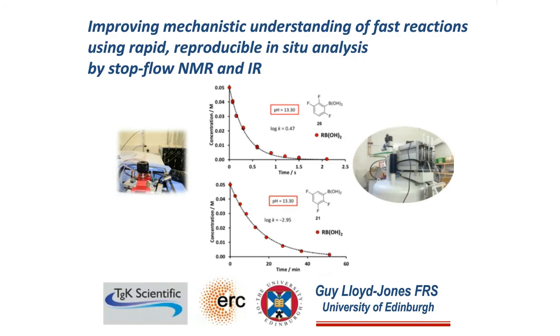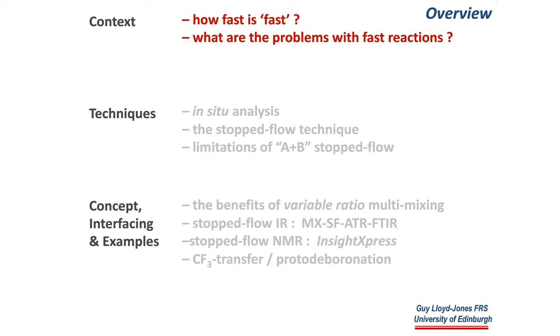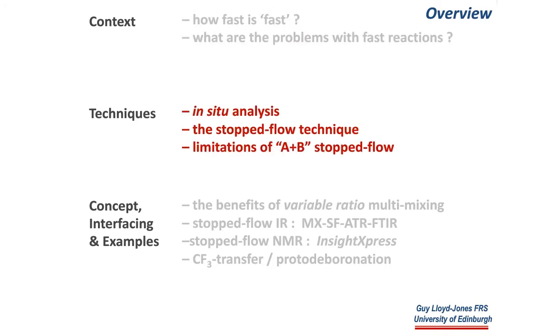In terms of an overview of what I'm going to present this afternoon or this morning, depending where you are, we're going to start with how fast is fast, which is a relative problem, and what are the problems with monitoring fast reactions. We'll move then on to looking at techniques for in situ analysis of reactions, and I'm going to particularly focus on the stop flow technique.